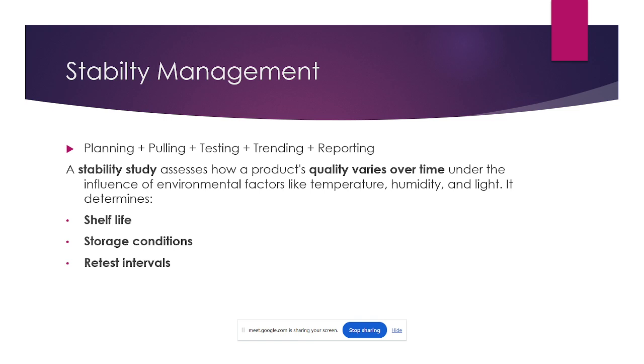Once the study is run, the stability management module helps automatically when the time comes. As per the study, initially you have to test at the 0 month. So 0 month samples will generate automatically, then the third month, and also 6 months will generate, based upon the time intervals you gave. Samples will generate automatically in the LIMS. No need to go and check manually whether the date has come or not.